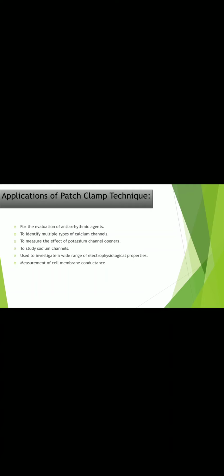This was how we use these techniques to study the membrane potential, or to study the current which is flowing through these ion channels. Thank you.